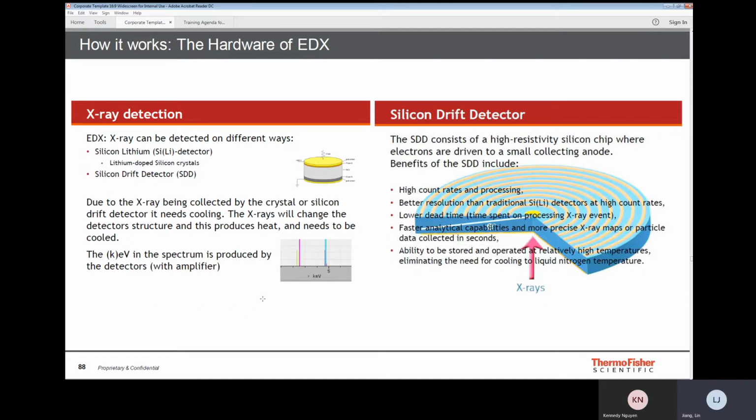It has four silicon drift detectors symmetrically arranged above the center. In your case, I think you have two large area silicon drift detectors placed above the sample.